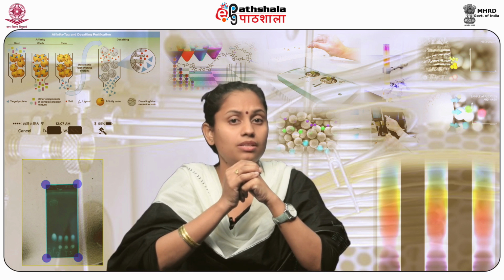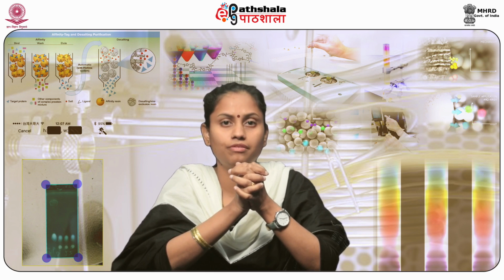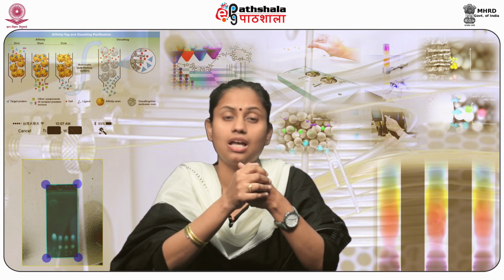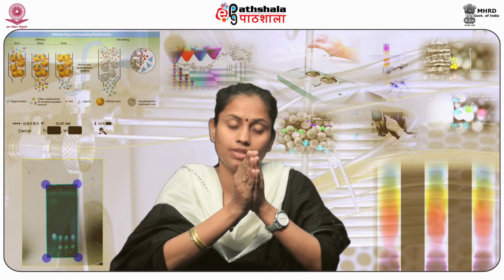Now, the size of resin beads and the cross-linking present on the resin affects the ion exchange efficiency. The flow rate of mobile phase also affects the elution profile of compounds that are present in the mixture. The performance of ion exchange chromatography depends on factors as discussed, such as pH, additives that are present in the buffer, which can be either salts such as NaCl, detergents, and Zwitterions. The presence of organic solvents also affects the elution of compounds. In the end, the temperature also plays an important role in elution as it affects the pH of the buffer.